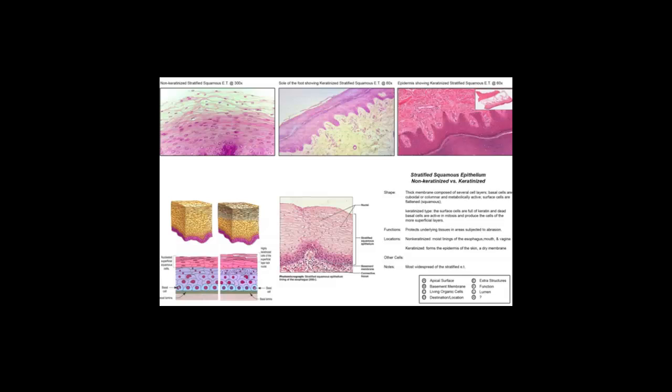Notice, as we've stated before in previous slides, we find the basal cells are more cuboidal, and as these cells divide and push out older cells or replace themselves and then move into this layering that we see here, they will become flattened and eventually, if it is in a skin layering, these cells will die off, be crushed, release keratohyalin granules, combined with lamellated granules that provide a means of prevention of water loss from our surface.